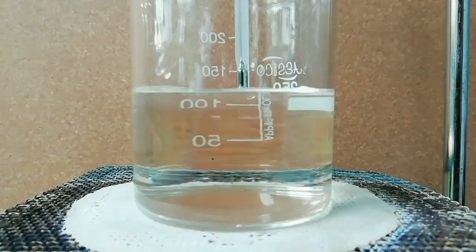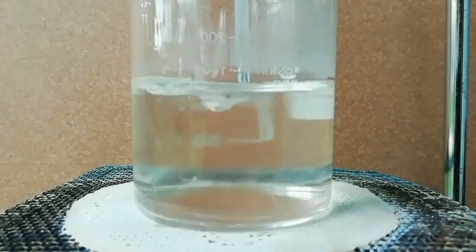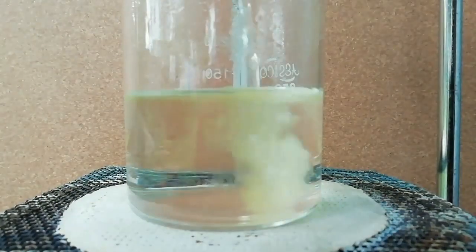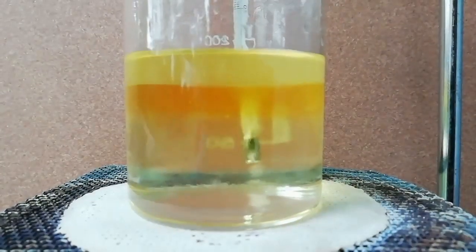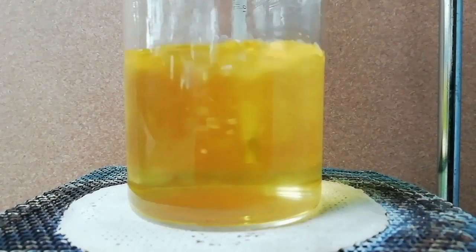My concentrated sulfuric acid was not clear — there was some black color impurity, so I decided to filter the solution. Then directly add the separated layer to the acid solution and stir for one hour.